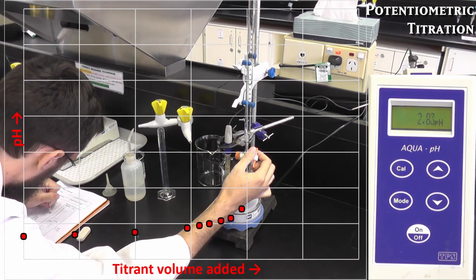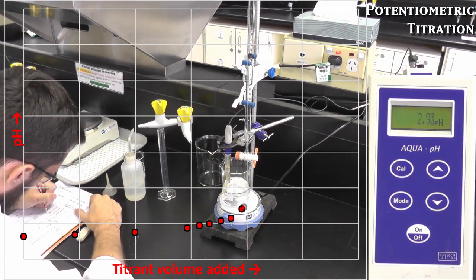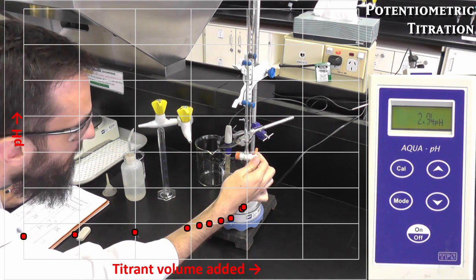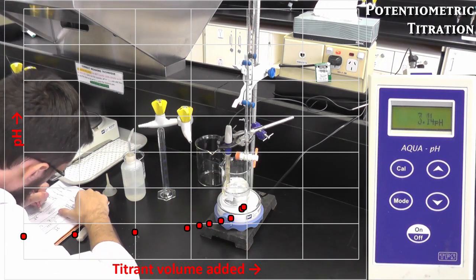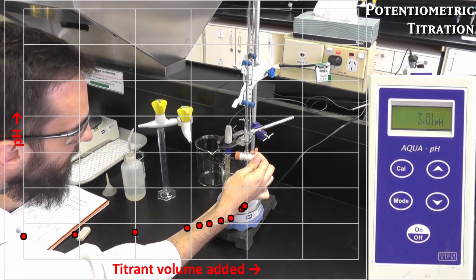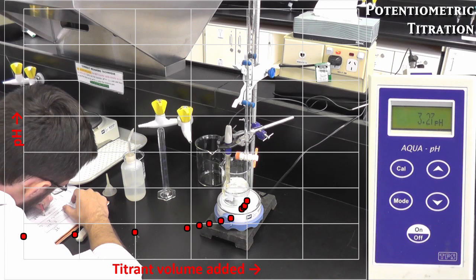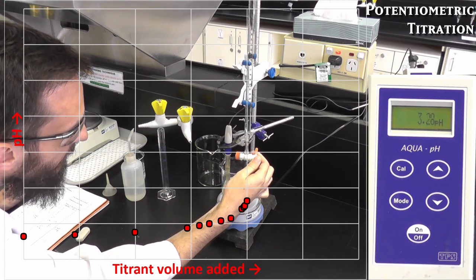As soon as this happens, slow your titrant additions down to 0.1 milliliter increments, as this is the critical region of data collection. You should notice that the slope of the leading measurements is increasing continuously until you reach a critical point, where a very small volume change leads to a huge change in pH.